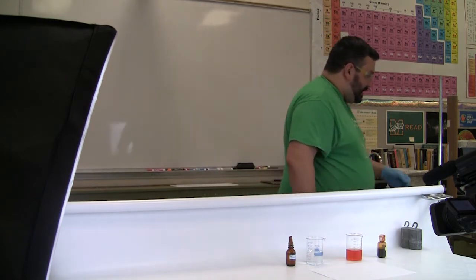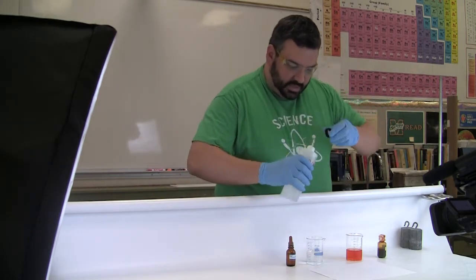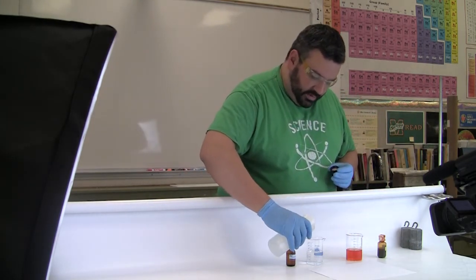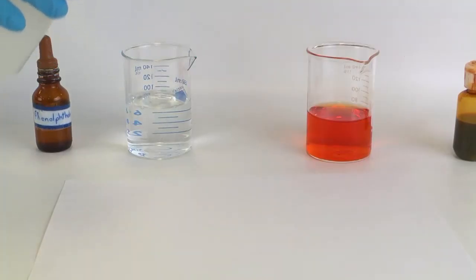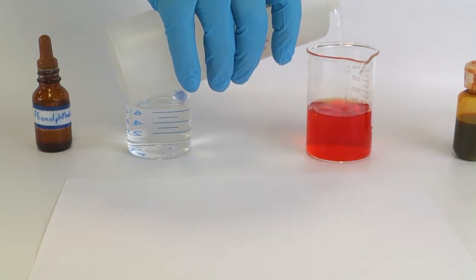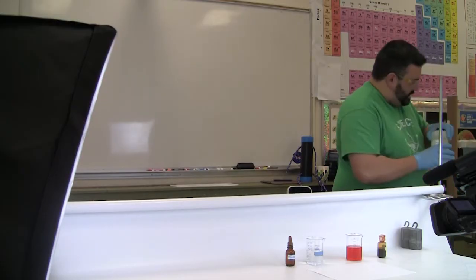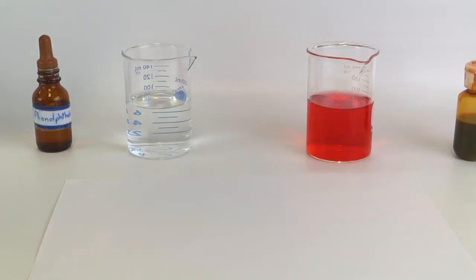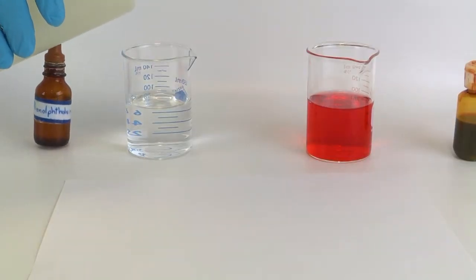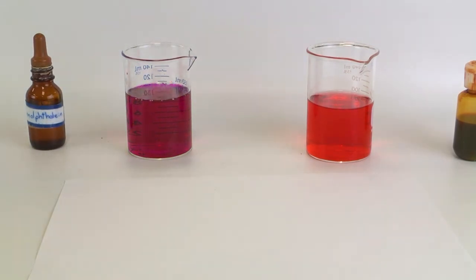So let's start off by adding just a little bit of acid to each, just to see how that's going to change. So just a little, I've left enough room here, so I can just add a little bit of acid, and that should stay basically clear. But as I add the acid to this, it should turn darker red, which it did there. And I can then add some base. I'm going to add a little bit more base. You can see instantly it turned pink.